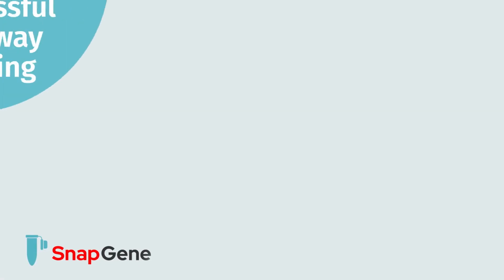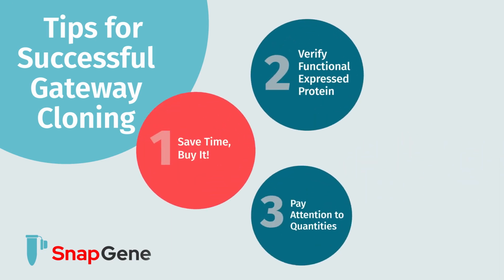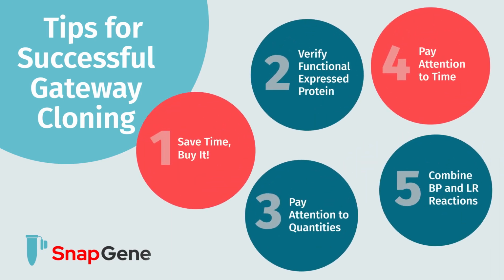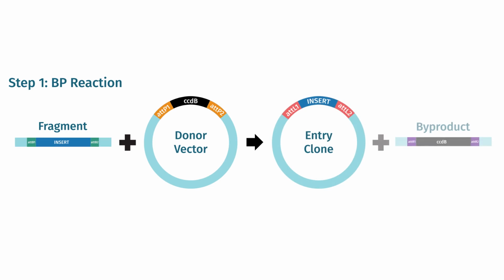Welcome to our video on gateway cloning, the two-step cloning system trademarked by Thermo Fisher Scientific. This video covers 5 tips to improve your success using the gateway cloning technique.